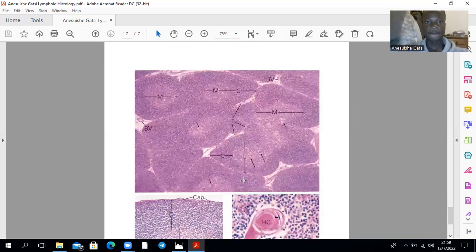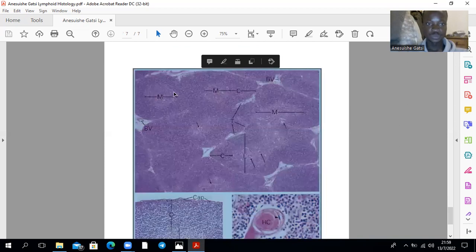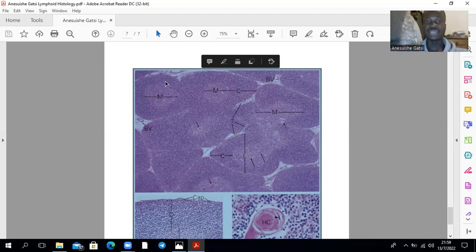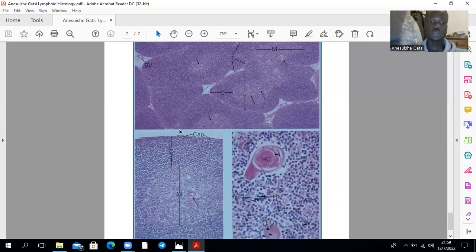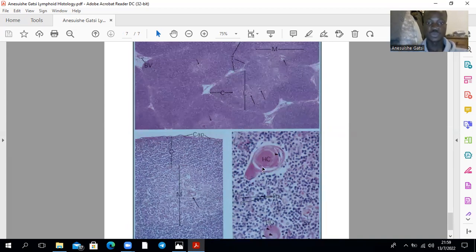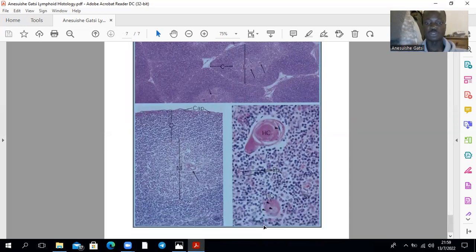This is thymic tissue. This is the medulla, which is lightly stained. That's the cortex, which is darkly stained. Notice there are no lymphoid nodules there. This is high magnification showing the medulla, where there's the Hassall's corpuscle. The Hassall's corpuscle can now be seen here — that's the Hassall's corpuscle. And all these are the epithelial cells. That's another Hassall's corpuscle right over there. That's a blood vessel right over there.